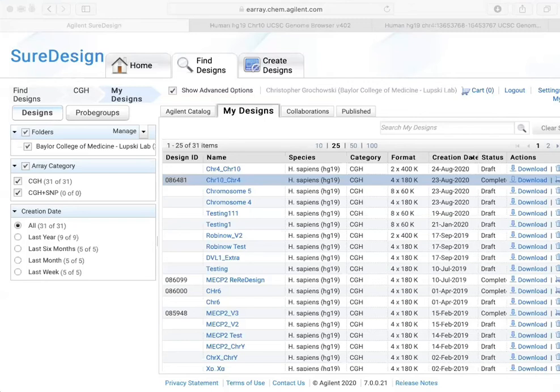It's weird that all of them are the same price. I think it's the cost of the chip itself, less about how much printing is done on the chip, as far as I understand. But the unit price the last time we ordered one was about $750 per chip.